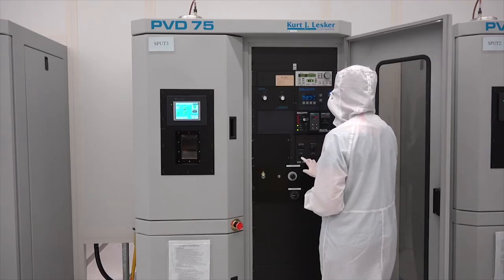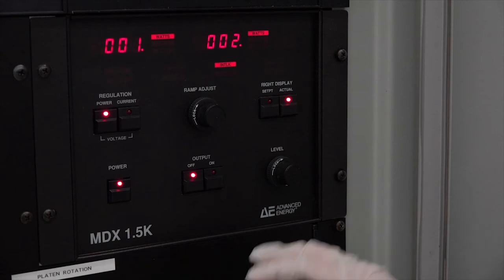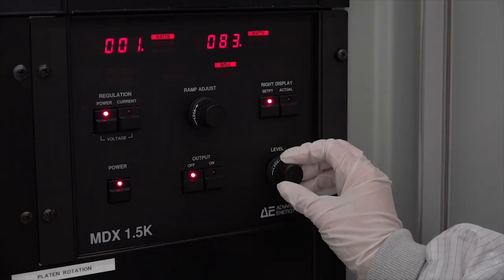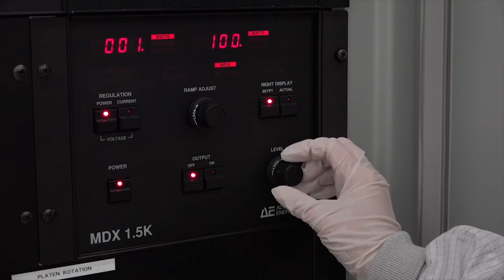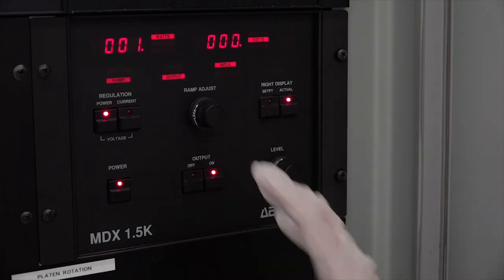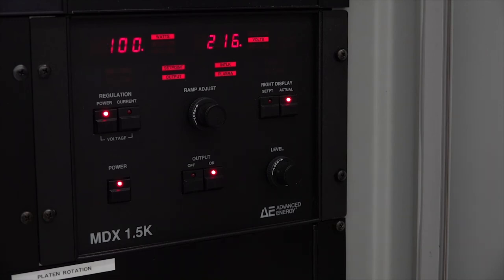This is done by applying a high voltage to the target, and to do this, we turn on the power supply that applies the voltage. The power applied is set on the controller. We must start at low power and slowly raise the power to avoid heating the target too quickly, which may crack it. The higher the power, the faster the source material is sputtered and deposited.